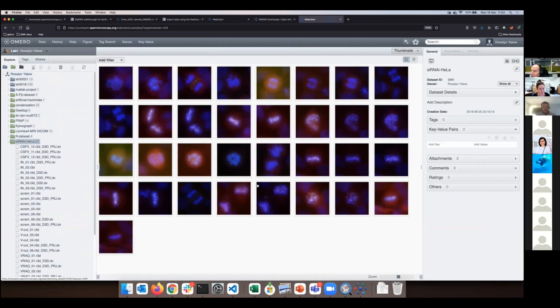Okay, I think I would slowly give space to the break. We are in an hour, and after the break, I will be showing you how to view the images in Omero iViewer and draw some regions of interest.